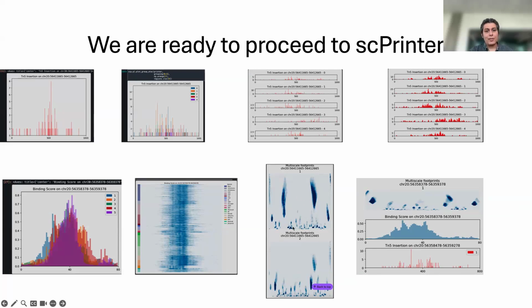But basically, you can think of them as footprints or as shadows that a transcription factor or a protein might cast upon your fragments as they bind to DNA. When they are bound to DNA, those areas are no longer accessible, or they have more limited accessibility by your transposomes, and that's going to make a footprint or a shadow, or it's going to cause a difference in your background that you can pick up.